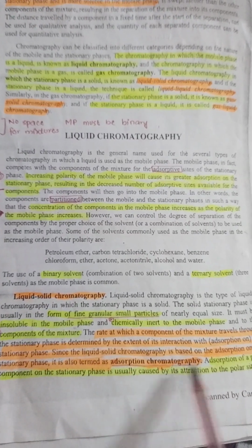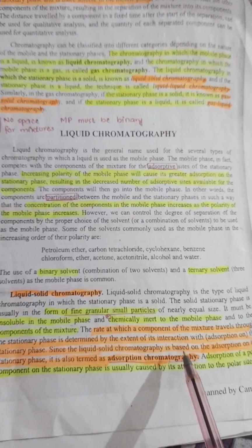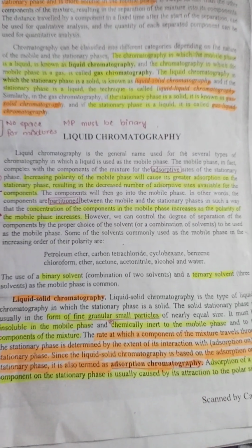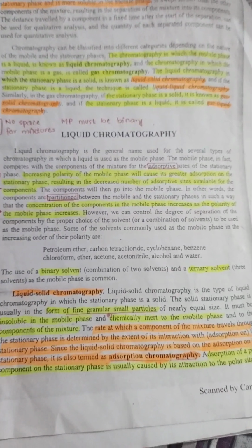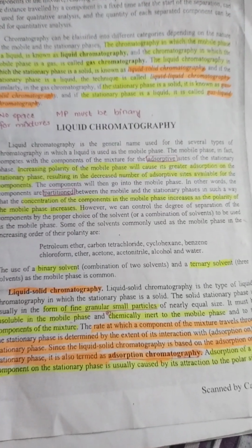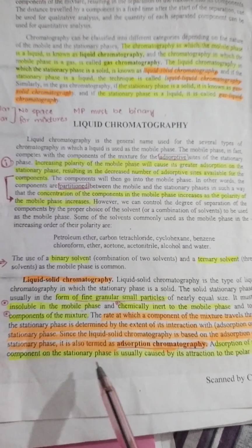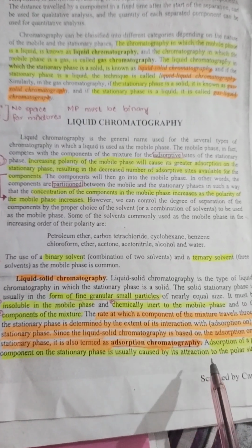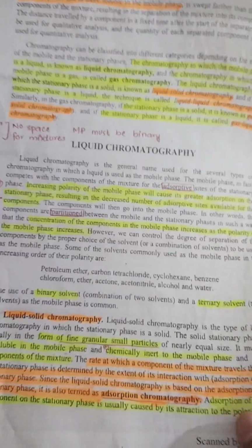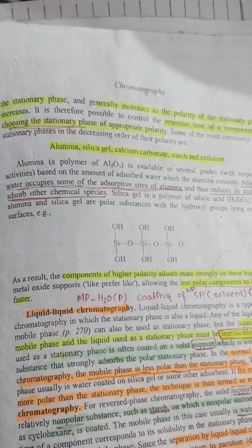So liquid-solid chromatography, based on adsorption on the stationary phase, is also termed adsorption chromatography, because the component is adsorbed on the stationary phase, tightly bound due to "like dissolves like": polar binds to polar. Adsorption of a polar component on the stationary phase is usually caused by its attraction to the polar sites of the stationary phase, and generally increases as the polarity of the stationary phase increases.